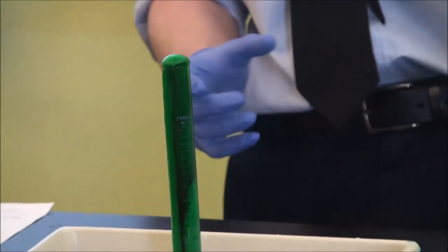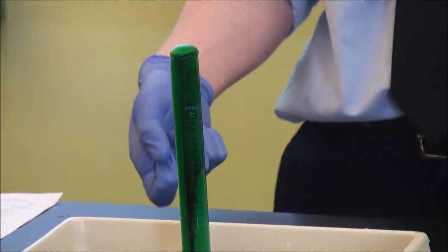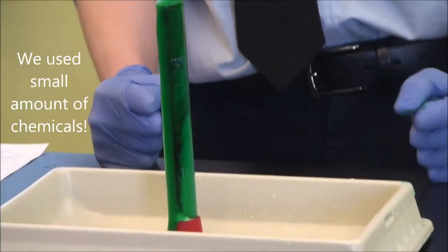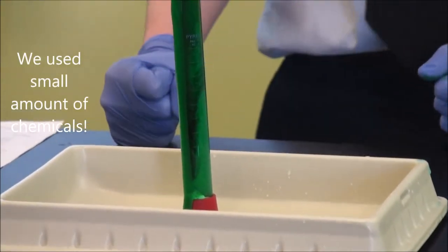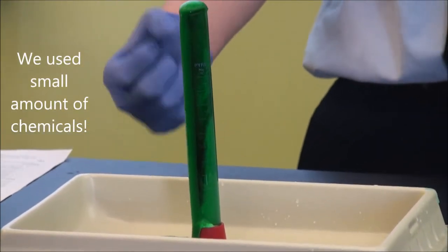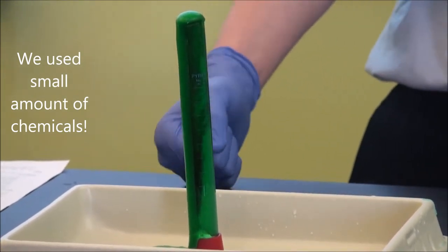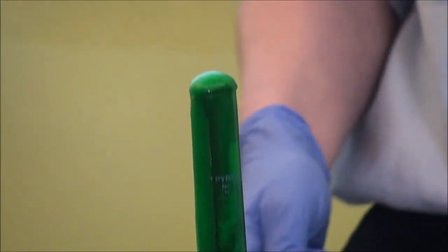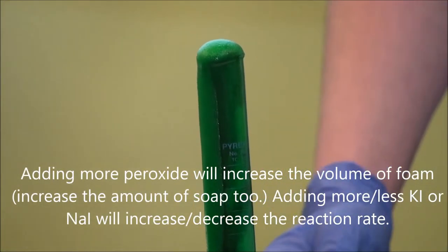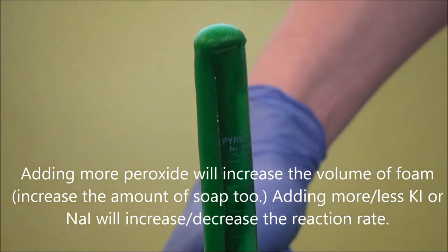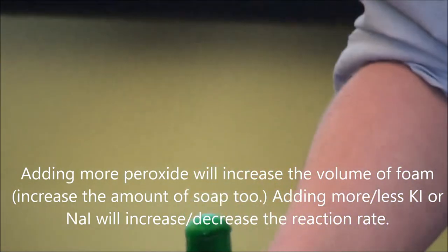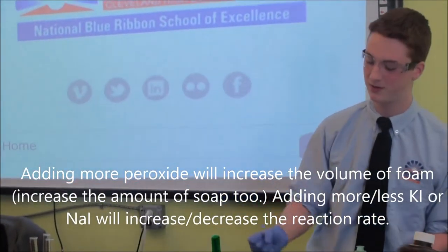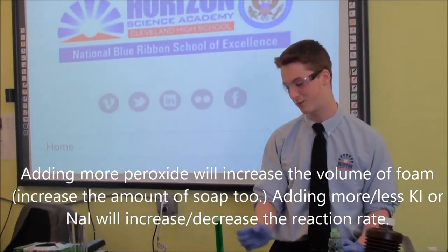So how this works is it's an exothermic reaction meaning that it gives off heat. Our catalyst, the sodium iodide, speeds up the decomposition of the hydrogen peroxide. It creates water and oxygen gas, which causes the soap to foam up and become foamy.